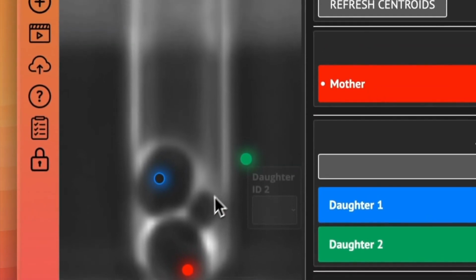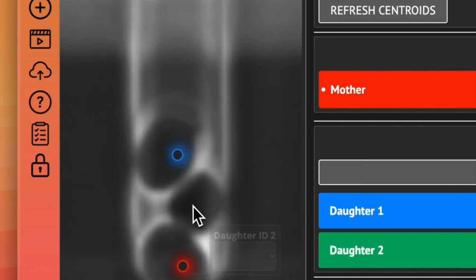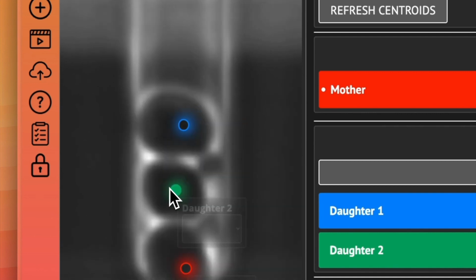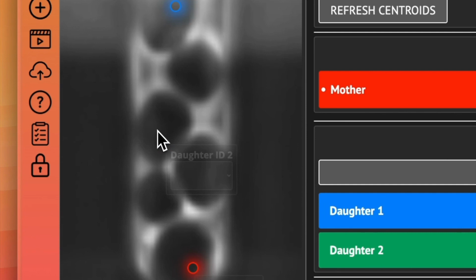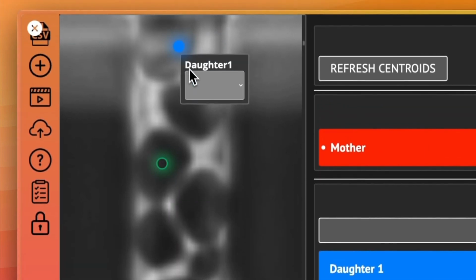Now let's say at this point right here we have a new daughter, right? So we can click somewhere else so that we can see it, and then now we're able to select our new daughter. Right, let's see it grow. Right here, you can see now this daughter is getting washed out, so we can say it's washed out.